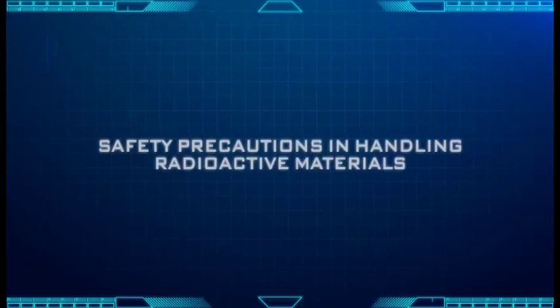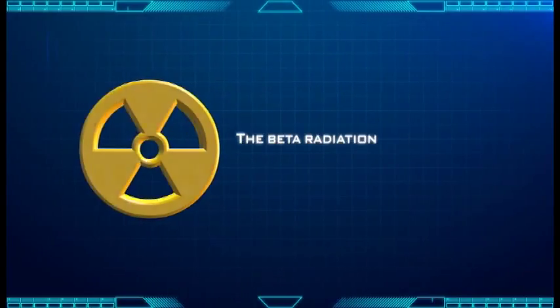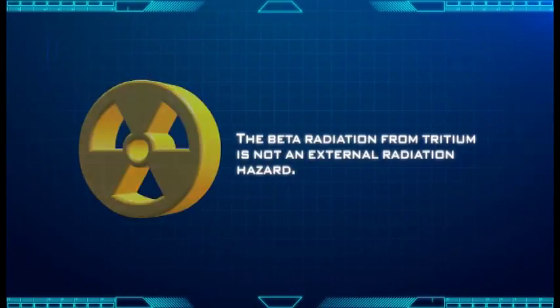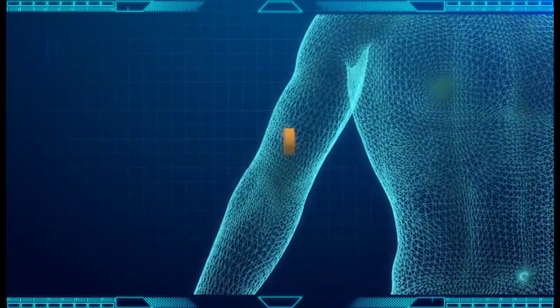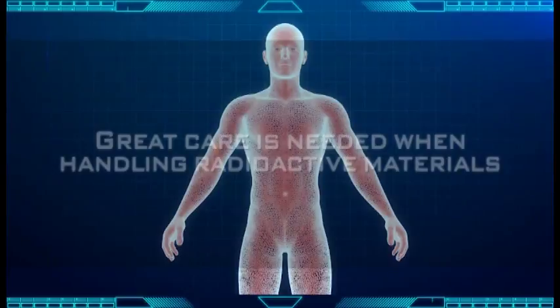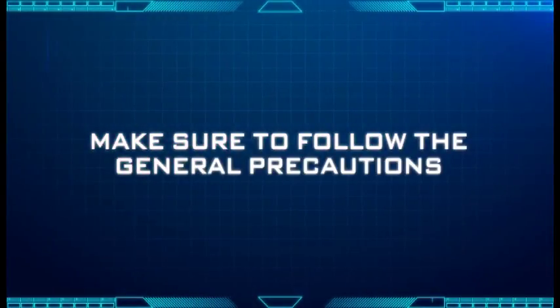Safety precautions in handling radioactive materials. Radioactive materials pose a hazard. The beta radiation of tritium is not an external radiation hazard. However, tritium may enter the body through ingestion, inhalation, or absorption through the skin and may result in an internal exposure. Great care is needed when handling radioactive materials. Make sure to follow the general precautions.